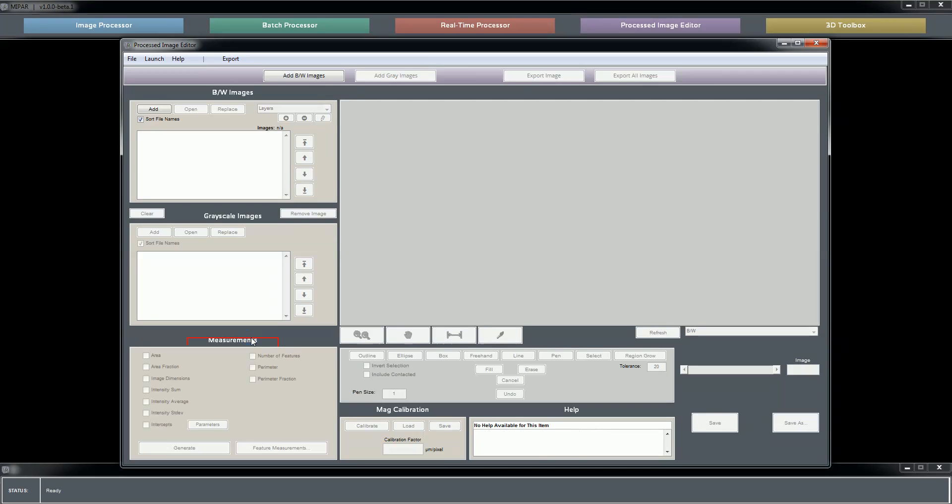Generating measurements, global or feature-by-feature, calibrating your magnification, and again your integrated help box. So here are examples where the help text has not been populated for elements. You'll find this most commonly in the processed image editor and 3D toolbox, but as I mentioned, they'll be filling in quite quickly.